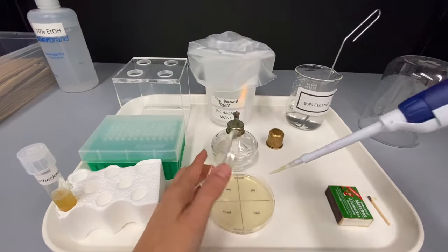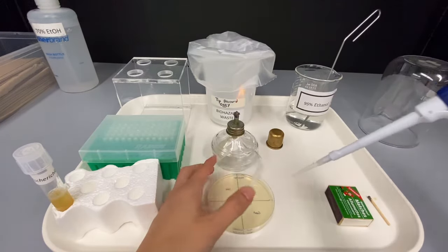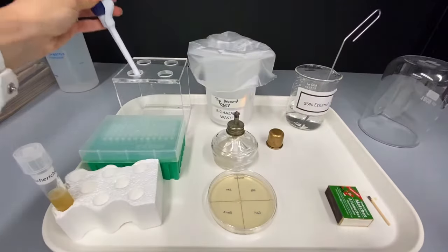Lift the lid, put your tip near the centre of the plate, then push the plunger down to expel the bacteria. Discard the tip in the waste container and then put your pipette back in the rack.